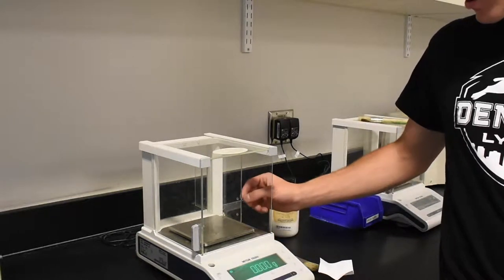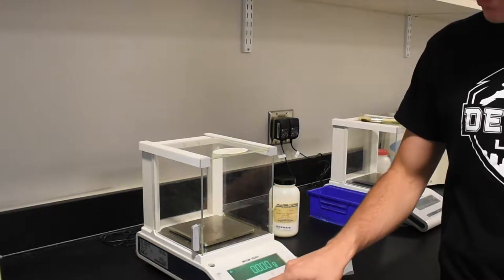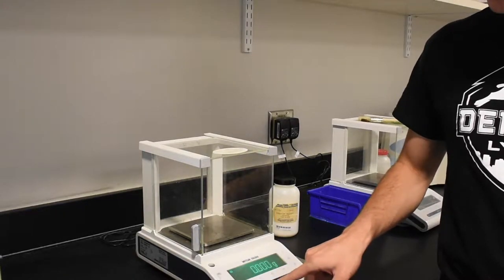The second step is to close the doors, turn on the balance using the power switch, and then tare the balance to zero.